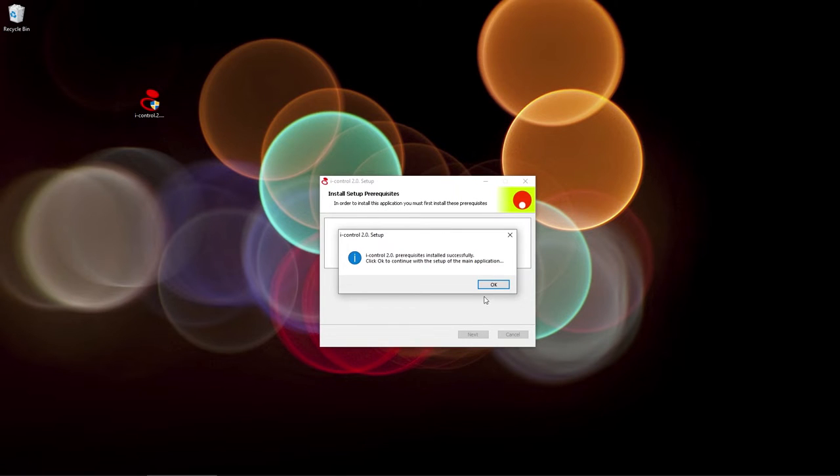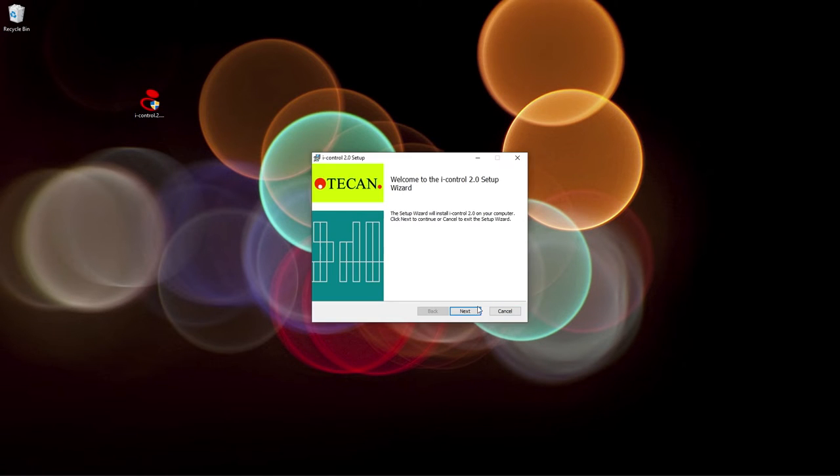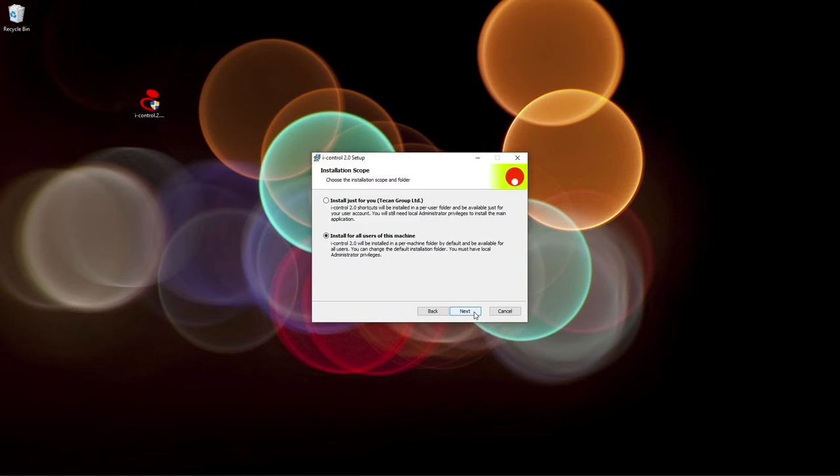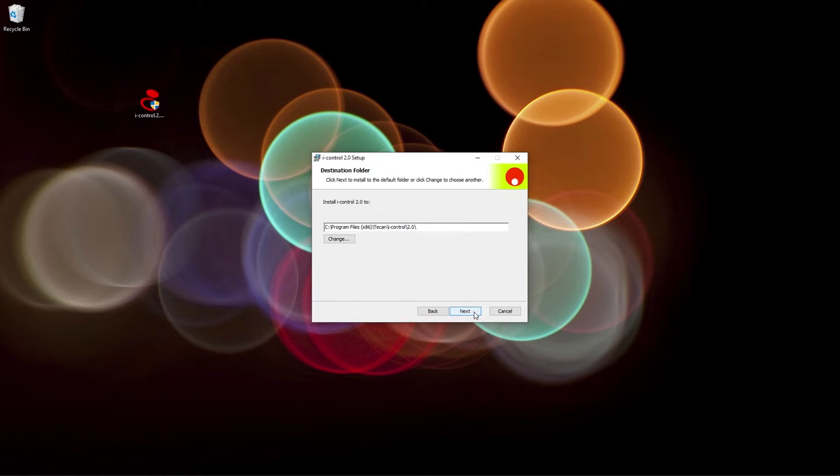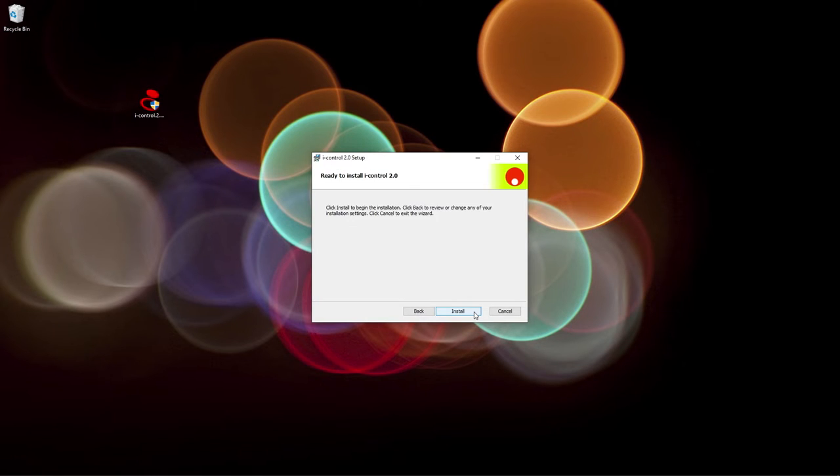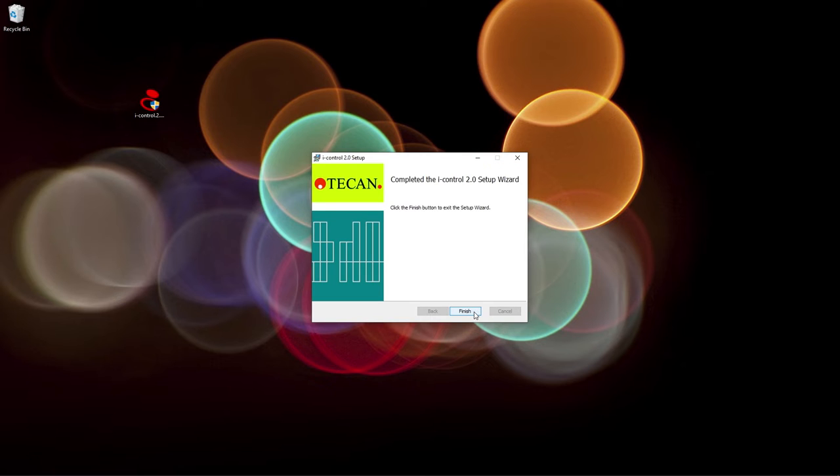Click OK to continue. Either install it for just your user or for everybody on this computer. Choose a language and then click OK to save in the default file directory. Once you've successfully installed the instrument software, you can now move on to the hardware installation.